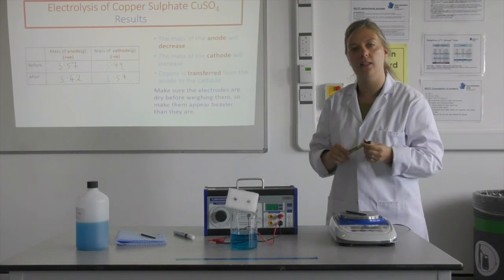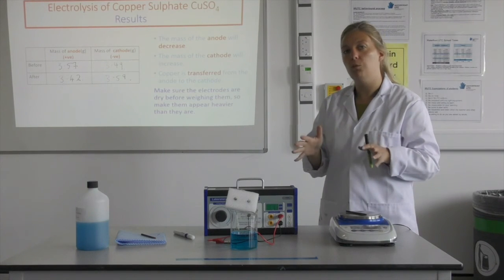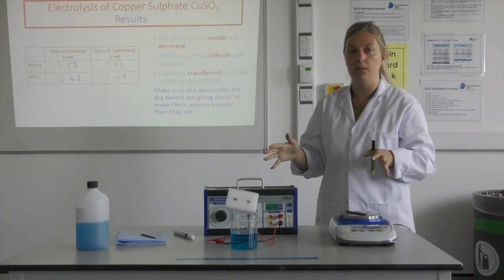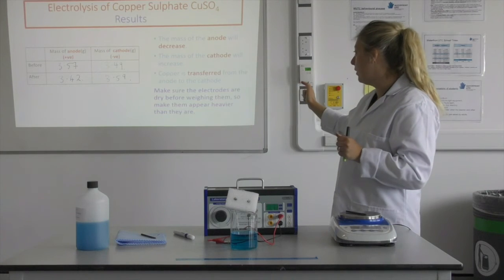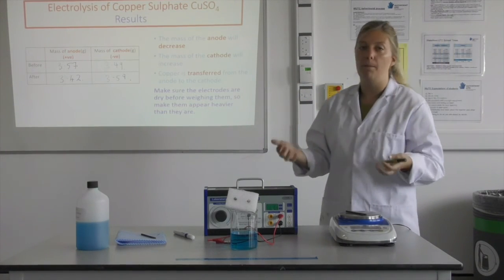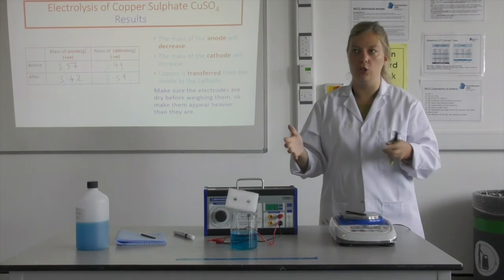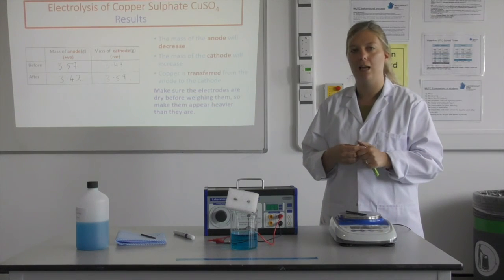And hopefully when you try this experiment, you get some nice similar results yourself. And just one point to note when you do this yourself, and the mistakes that are normally made, remember to measure the mass beforehand, and remember the electrodes to dry them before weighing them so that they don't appear heavier than they actually are. So you might now have a go at doing this yourself, or you might just be watching this video for revision. But I'll move on to some exam style questions for you now.